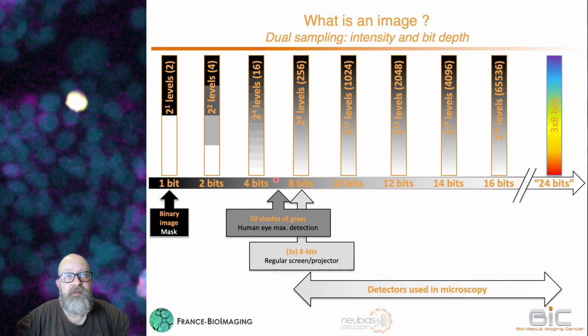On the 8-bit scale, you have different possible levels. In fact, you've got in total 256 possible values. As the values are starting with 0, so this is a minimum, this corresponds to pure black, the pure white would have a value of 255, which makes a total of 256 levels.